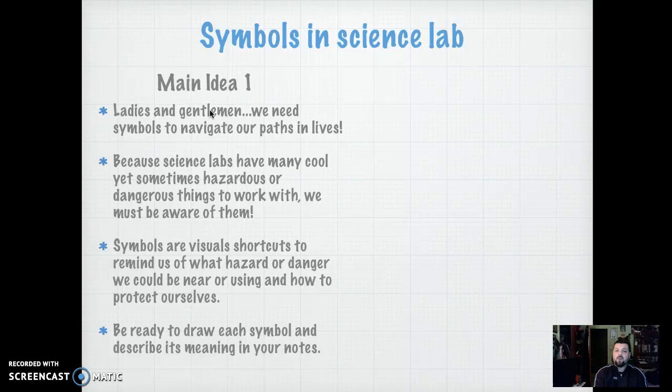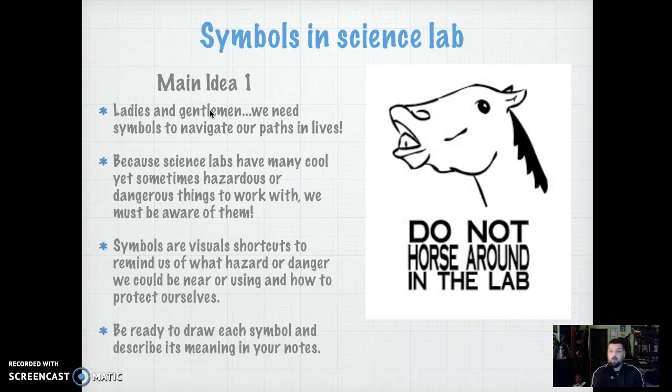I want you to be ready to draw the symbols and to describe their meaning in your Cornell notes on the right-hand side. So when we say don't horseplay, we mean no horseplaying — that's an actual rule. No horseplay in the lab.